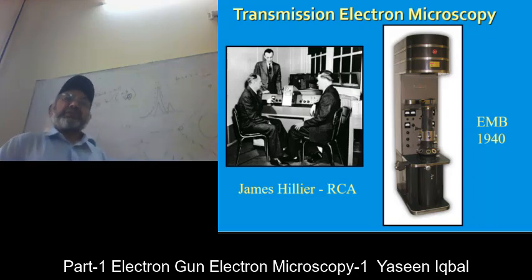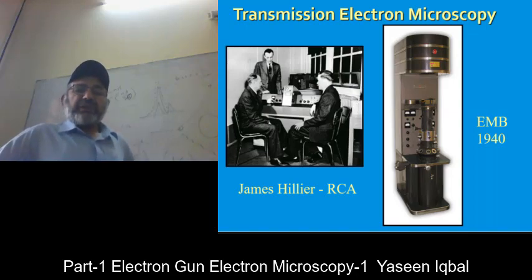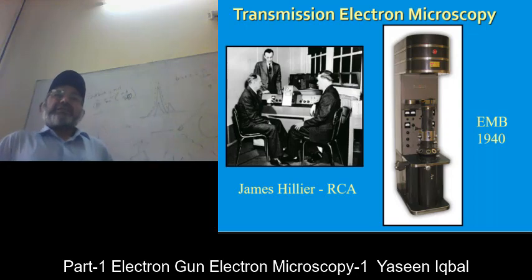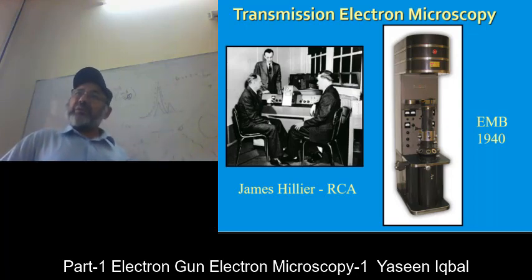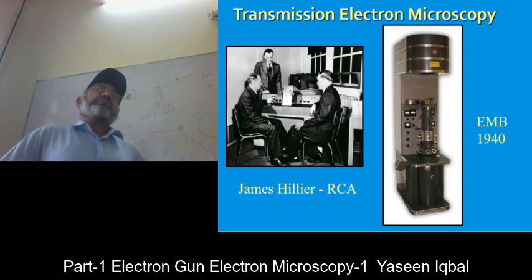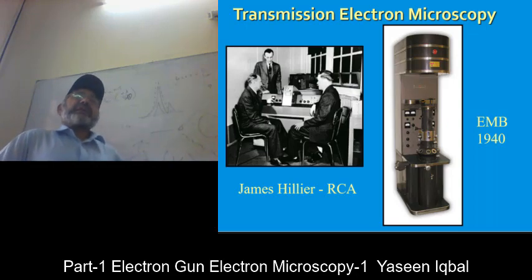So sample preparation is also a big step in electron microscopy, and I frequently tell you that it is science, but at the same time it is a skill as well. If you are skilled enough, you are careful in doing things, then your job will be much easier. For example, if I tell you to prepare a particular composition of ceramics, you try your best, but you can't prepare the ceramics with optimum properties.